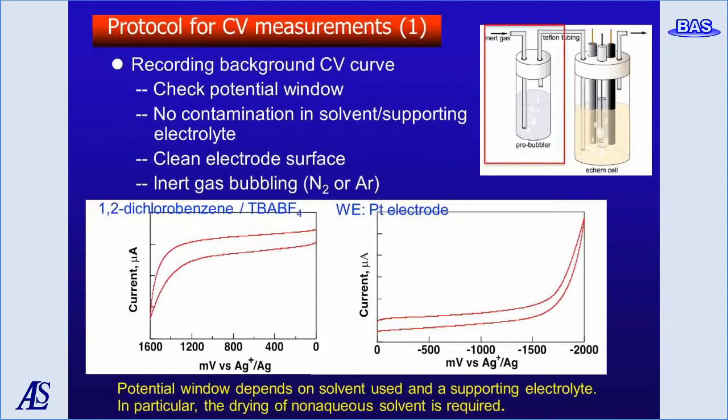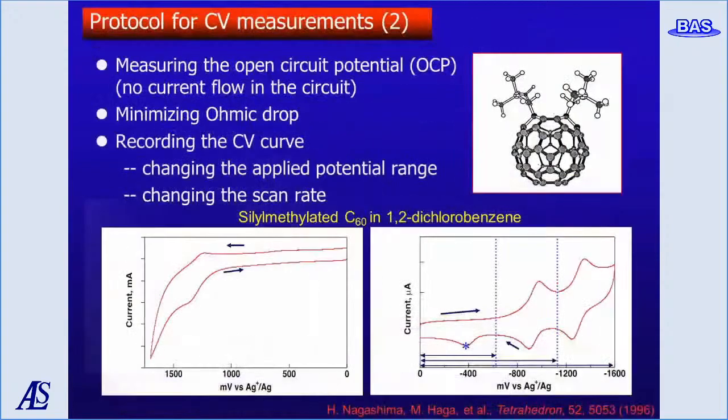So this precondition check for the CV is always required. We call it background checking for CV measurement.